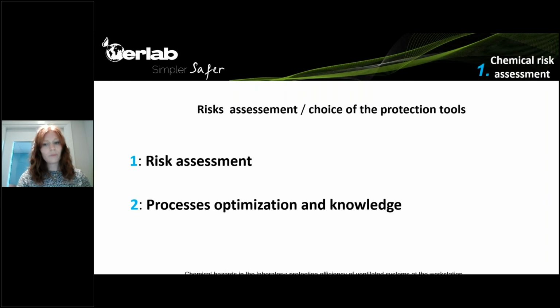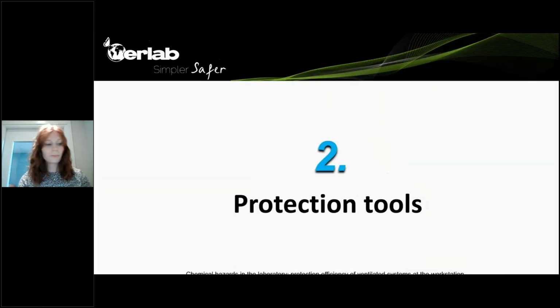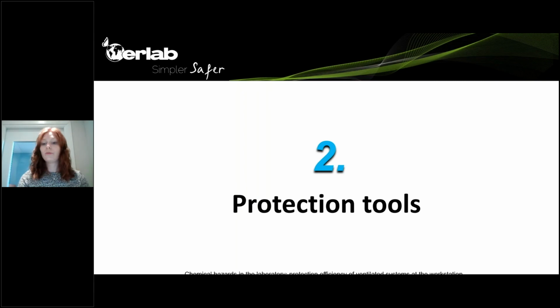So the first step is to understand the risk present in the laboratory, and the second is to choose the right protection tool. So now we're going to go through the different protection tools that are available for the laboratory personnel.